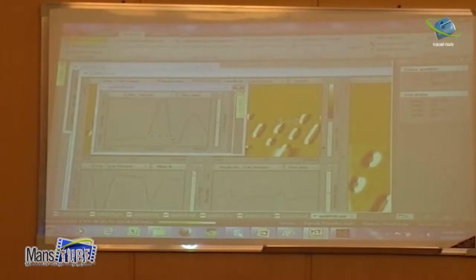This is plastic, right? How would you estimate the molecule size? It's in the nano range. I mean, I can make it smaller. But plastic is usually big molecules. I think it's a few tens of nanometers, the molecule of plastic. Is it right? Polymer. Maybe 10 nano, maybe more, maybe less. How much? Approximately, right? You don't know.